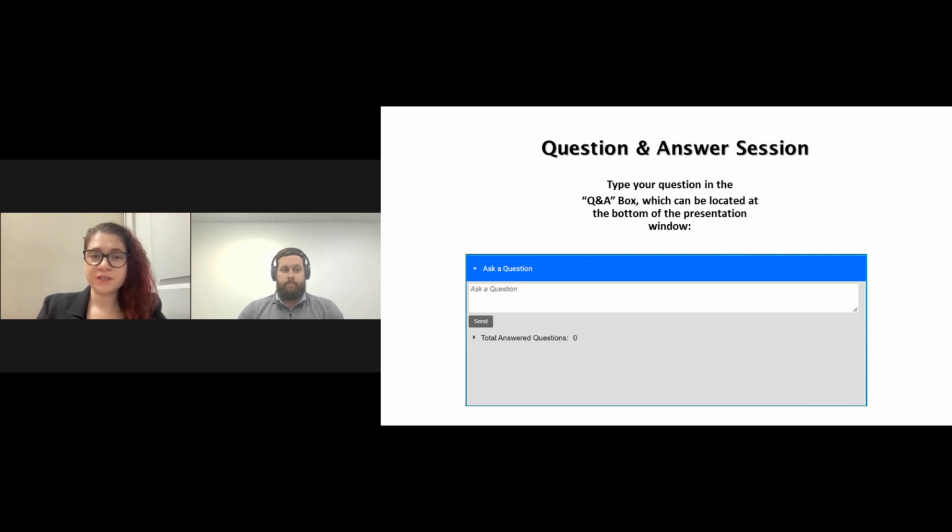Wonderful. We have another question here about compatibility, which is asking, is it compatible with all Shimadzu GC detectors? That's a great question. I believe we touched on this in the presentation as well. Currently, the available detectors for the Brevis GC-2050 are the FID, the ECD, and the FPD. Our other existing models like the SCD, the BID, and the TCD, all of those are coming very soon.